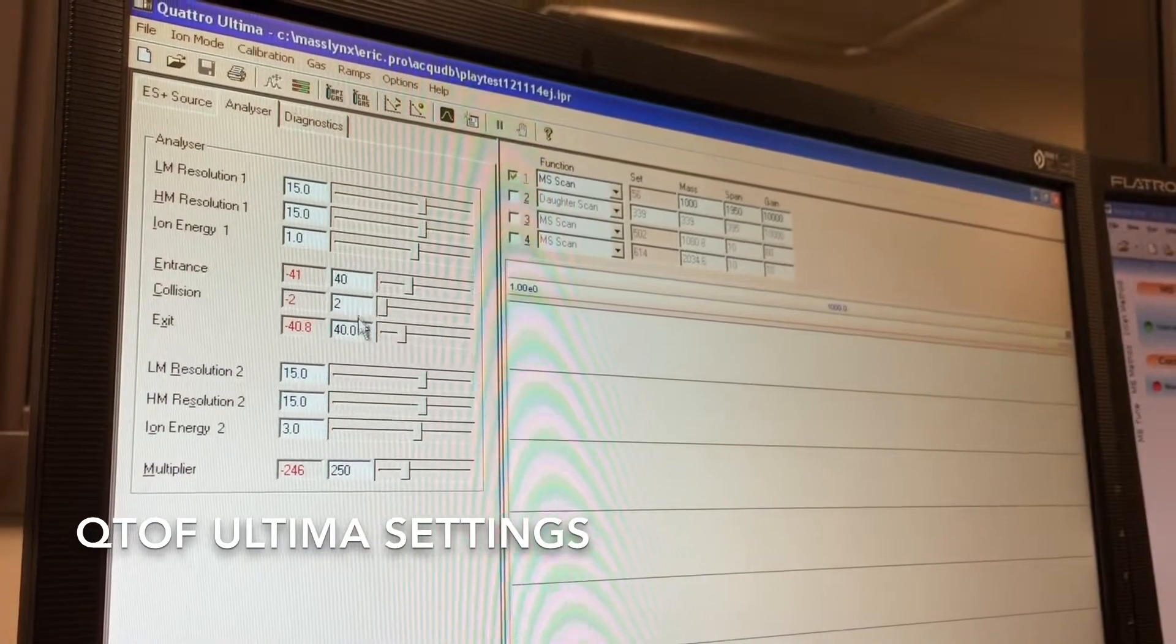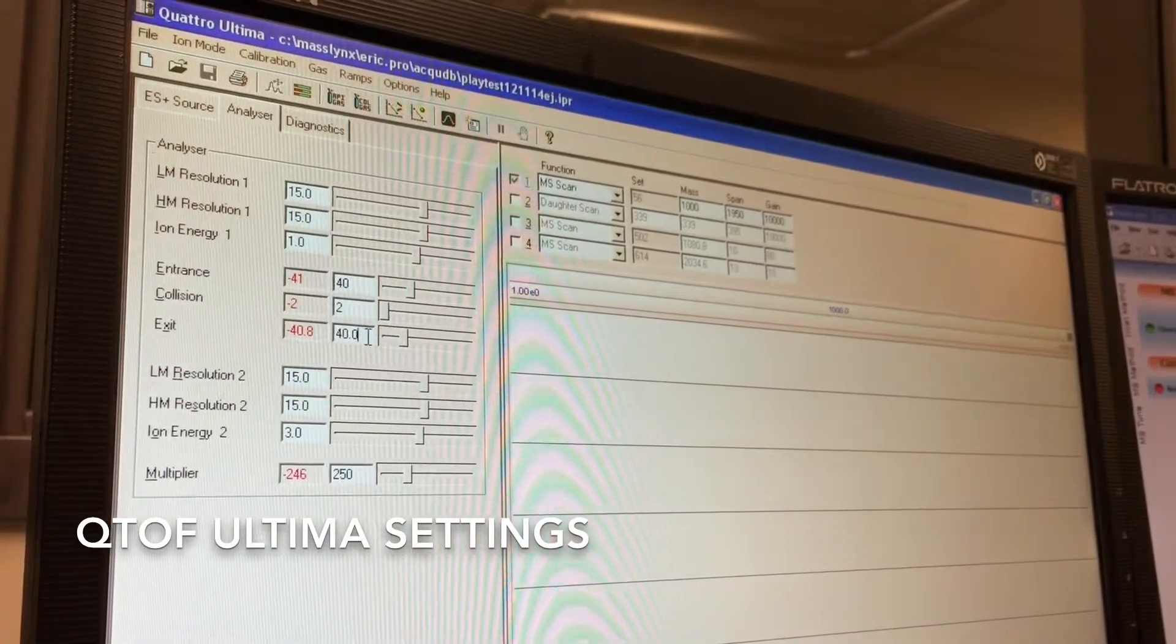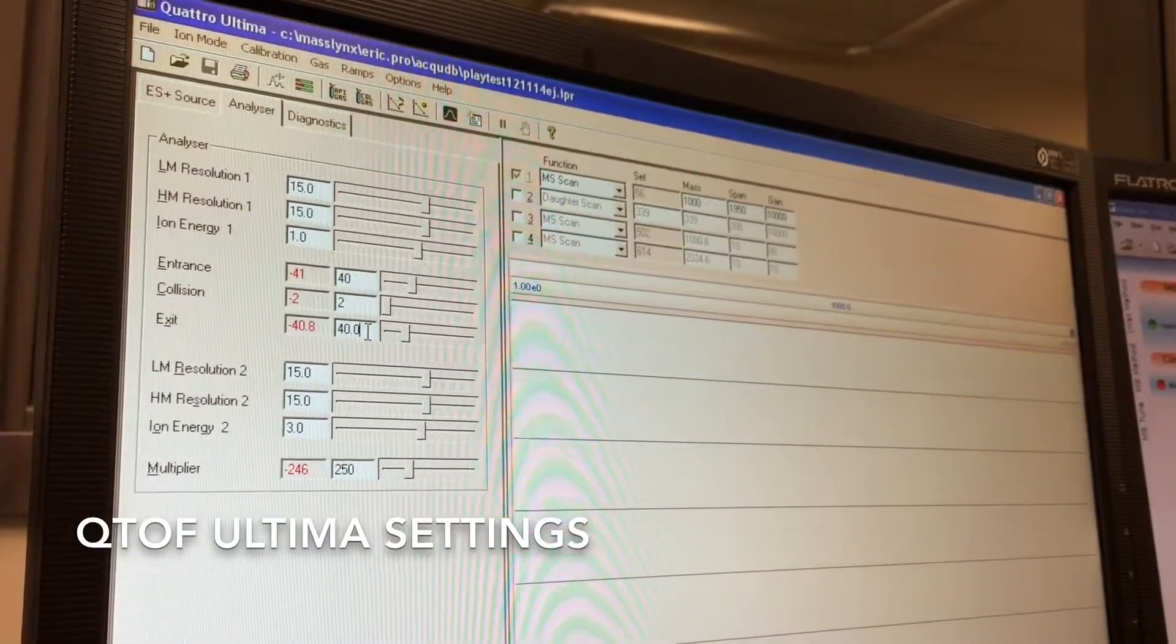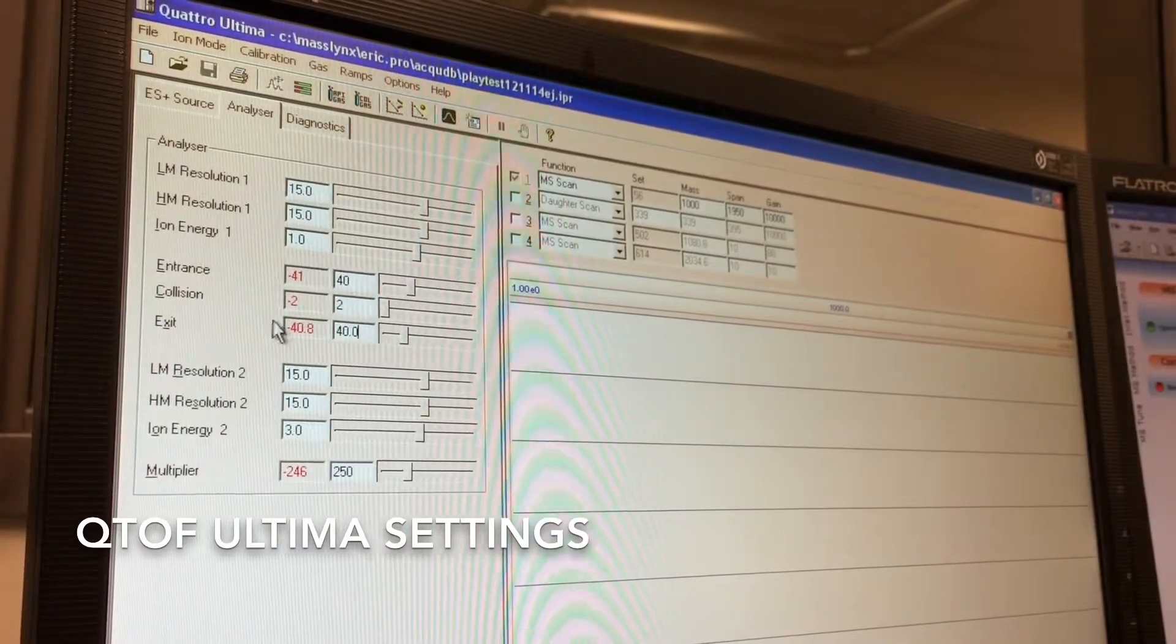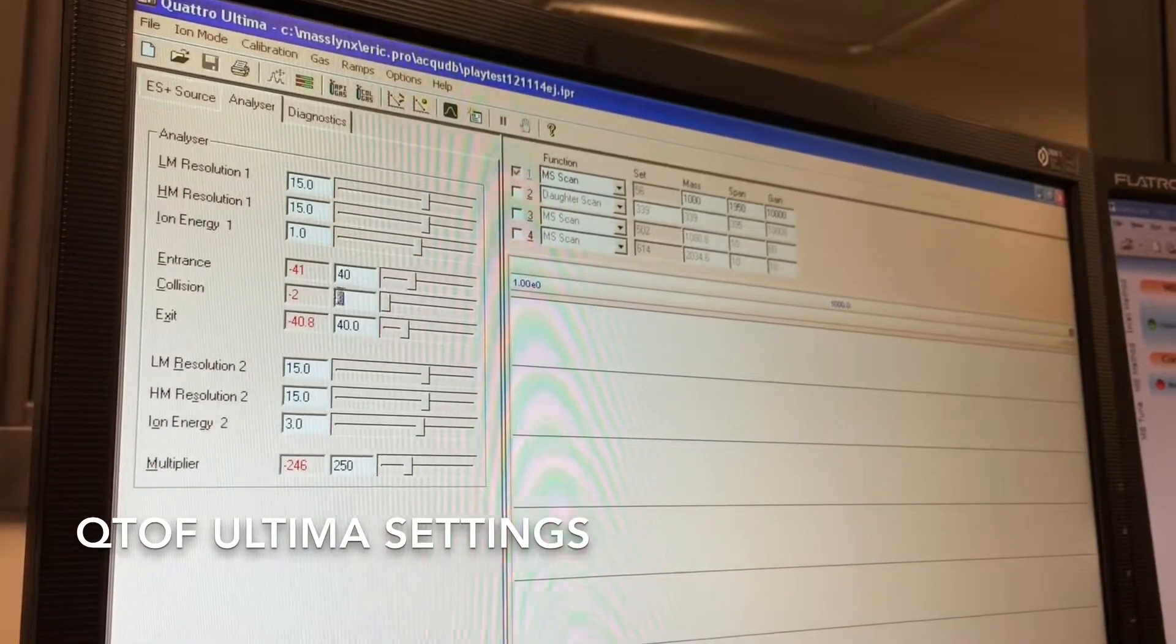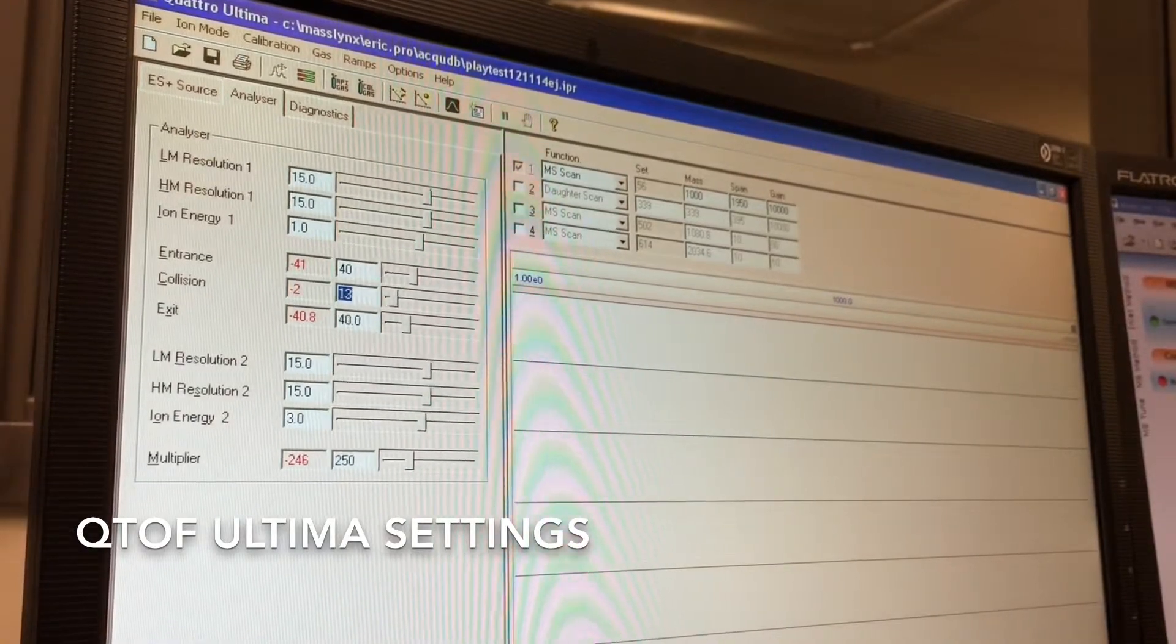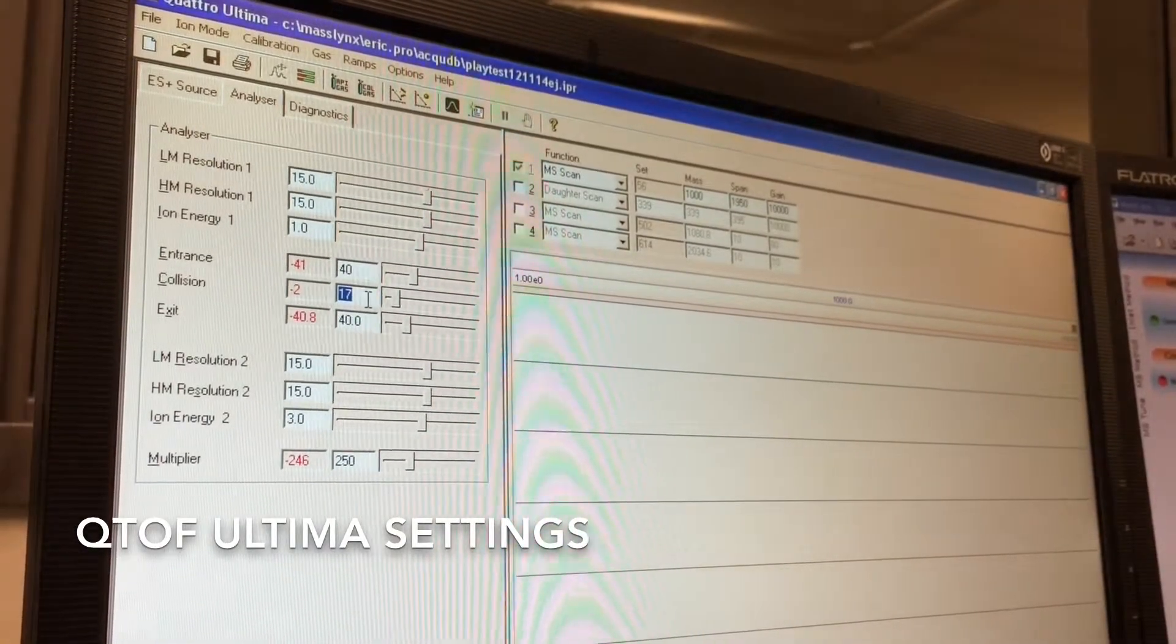The entrance, collision and exit for a regular full scan can stay at 40, 2 and 40. Obviously if you're doing a MS-MS, you will increase this number here, this value here, as you want to increase fragmentation.